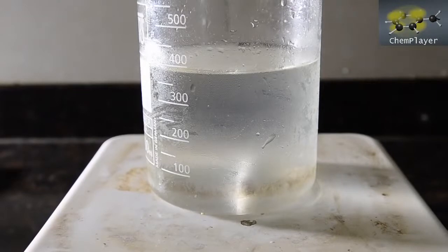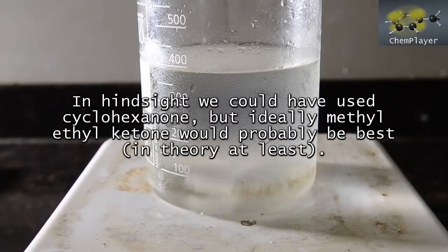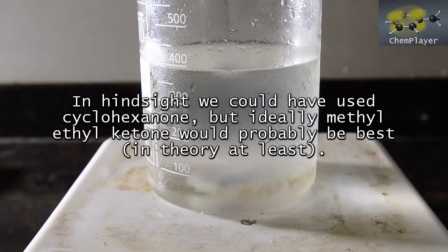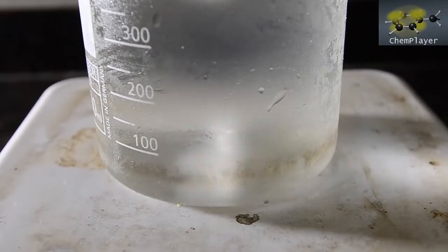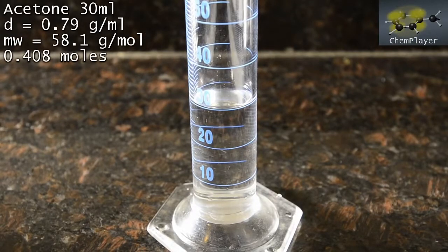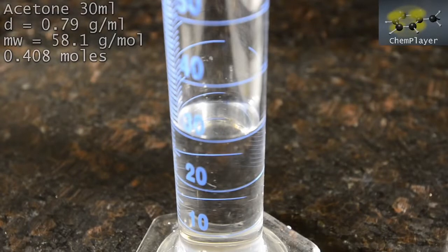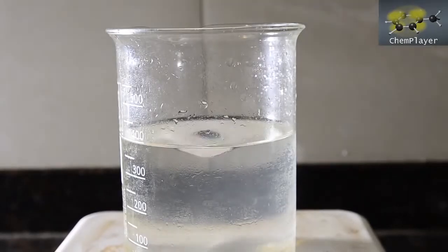The best ketone to use would be methyl ethyl ketone, as the oxime apparently forms an insoluble layer. But we've only got acetone, so we'll try this. First we get the mixture stirring. And now here's 30 ml of acetone, which in theory should be enough to turn the 100% yield of the hydroxylamine disulfonate into the oxime. So we add this to the mixture.